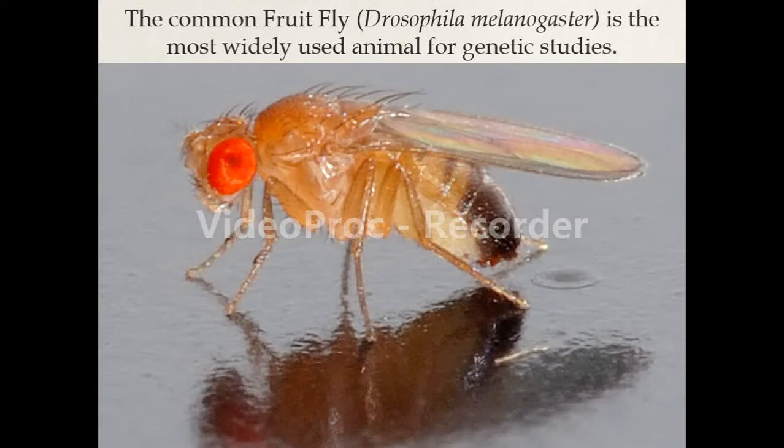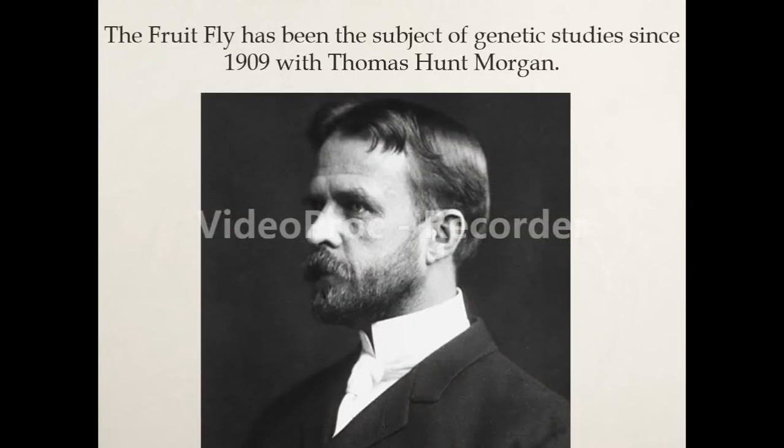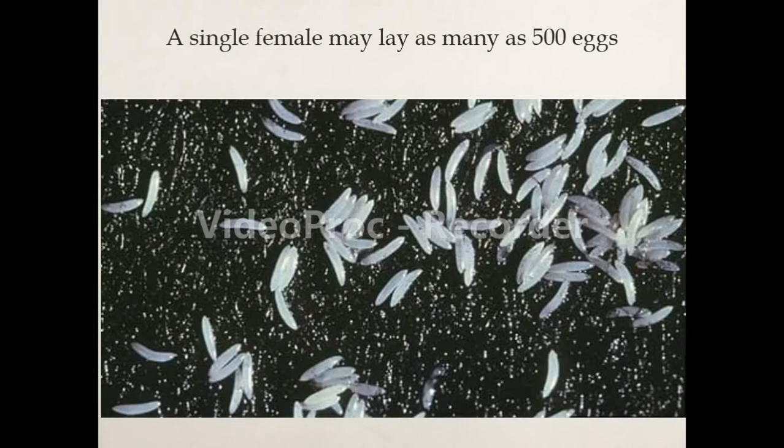This is the microscopic view of the Drosophila fly. And who was the first scientist? Thomas Morgan was the first scientist who used the Drosophila for studying genetic structure. In 1909 the genetic structure of the Drosophila was first studied. But before studying it, he prepared the Drosophila in the following procedure. First of all, we tell you some knowledge.